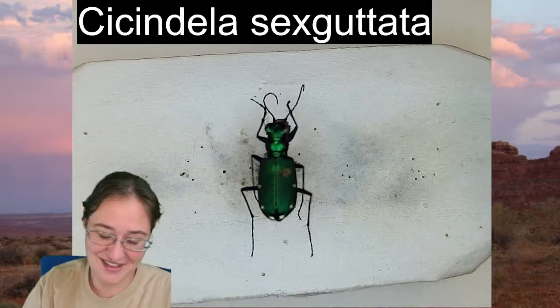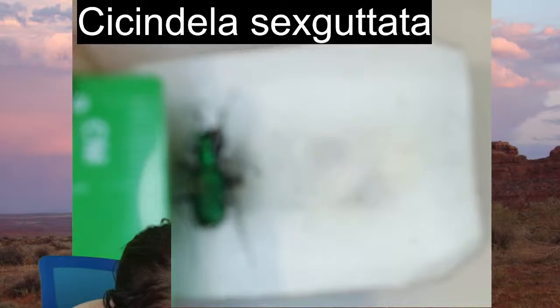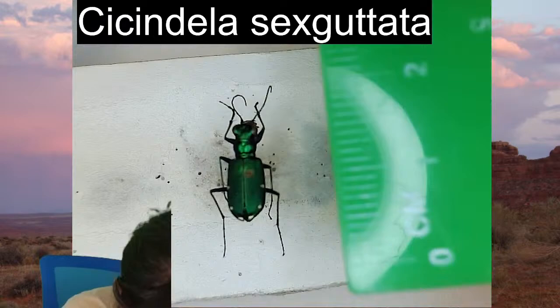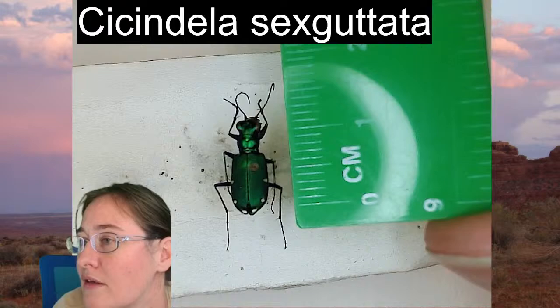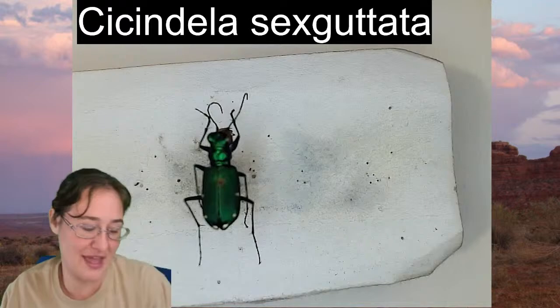All right. So, we're going to be taking our friend here, we're going to be putting it under the microscope, but while it's here, we might as well get a decent measurement of it. Tiger beetles have very, very fragile legs, so I have to be really careful with it. Regularly, legs and antenna fall off in these specimens. So it looks like our specimen, if we were measuring from the back of the abdomen to the front of the head, I would say it's about 1.25. Somewhere between the 1.2 and 1.3 mark on the length of this specimen.